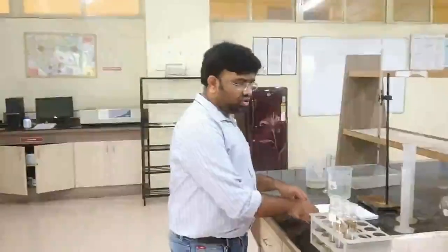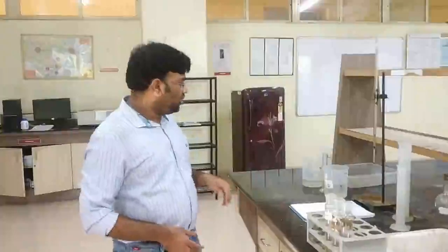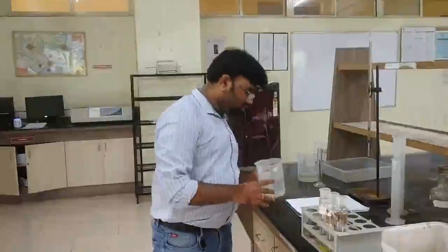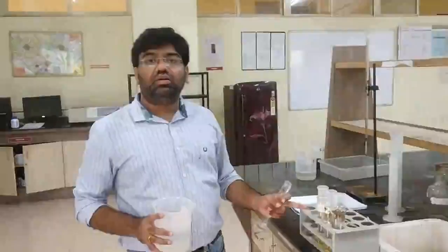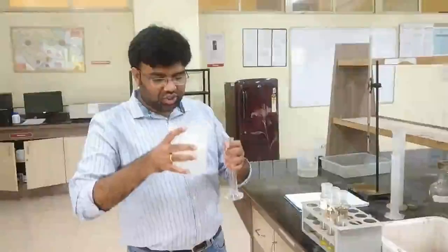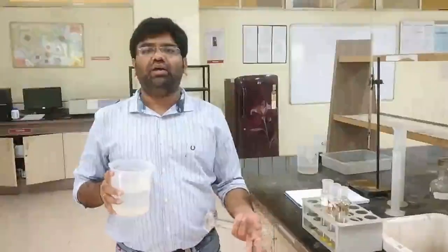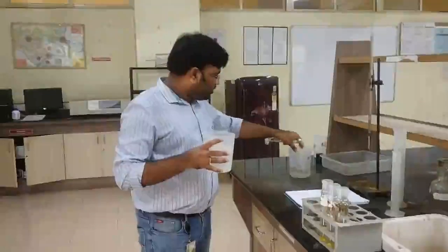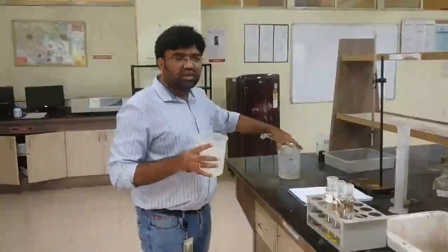So the next step is to add 20 ml of sample into each of these flasks. Now remember, your distilled water for the blank is in itself a sample. So in the blank we are going to add 20 ml of distilled water, and in all the other two flasks we are going to add 20 ml of the sample. The sample in our case is this particular lake water that we have collected. So that we are going to add.